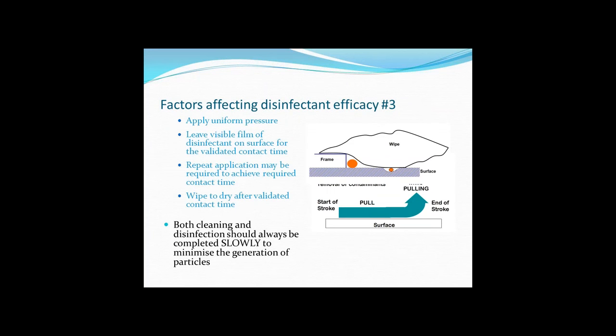Then there is the method of application. Both cleaning and disinfection should always be completed fairly slowly to minimize the generation of particles. It's also important, where possible, to apply a uniform pressure, to leave a visible film of disinfectant on the surface for a set contact time. It might be necessary to repeat the application to achieve the required contact time.